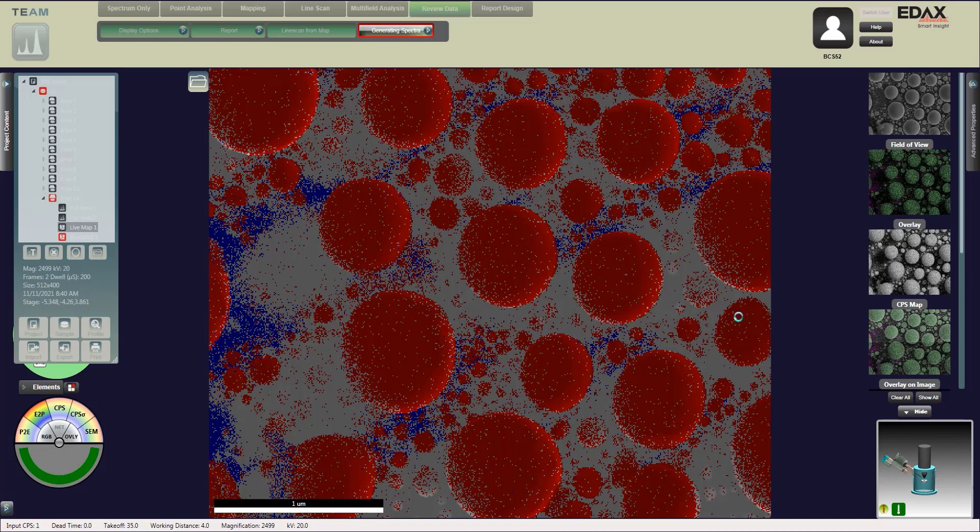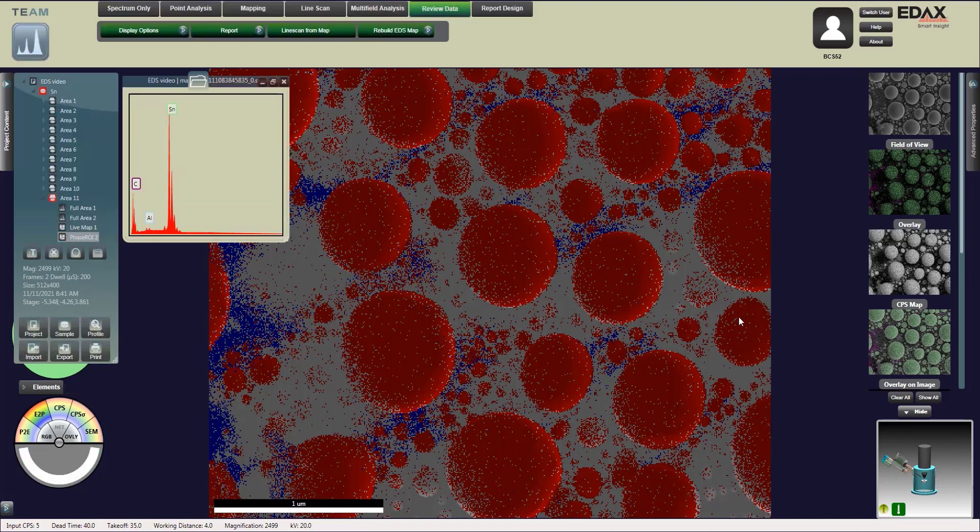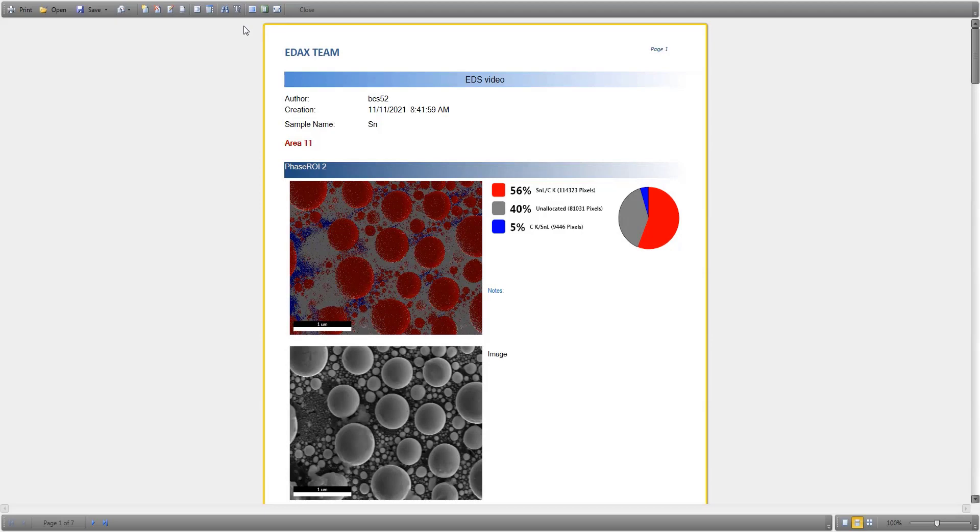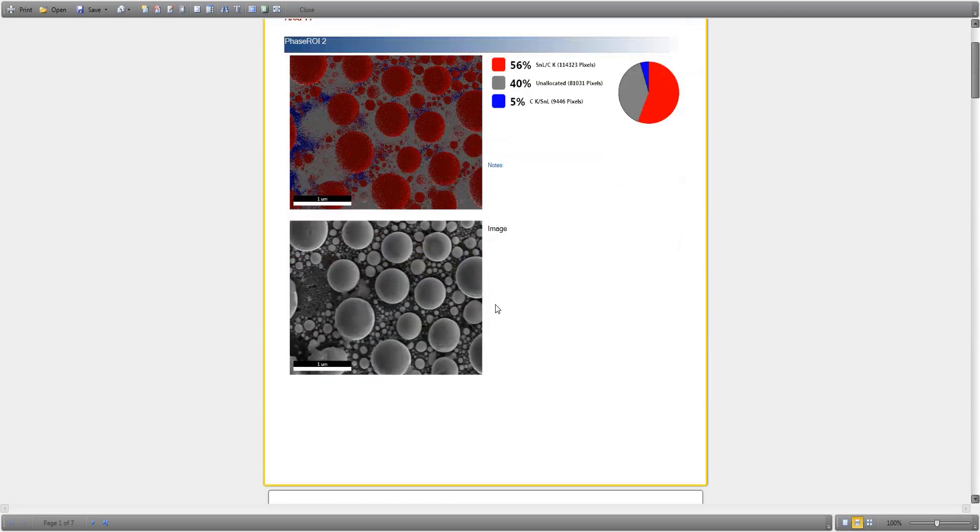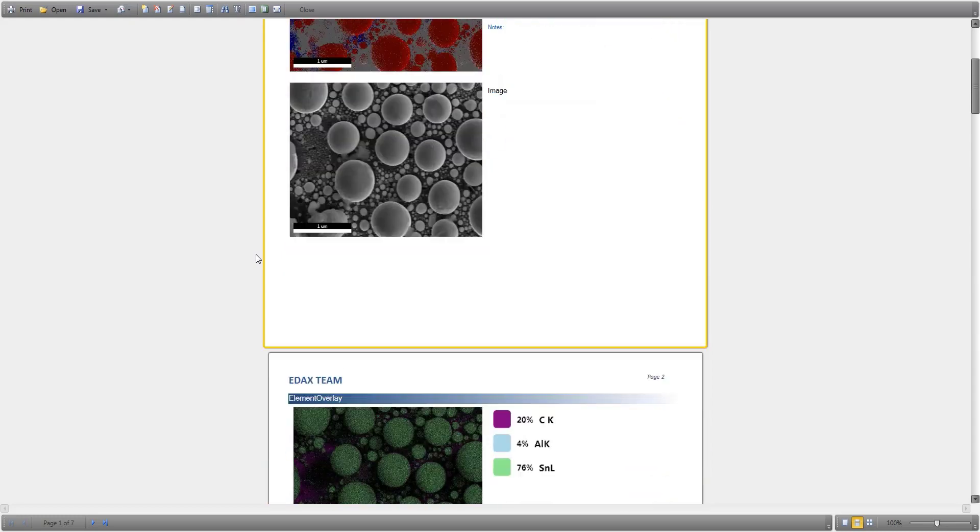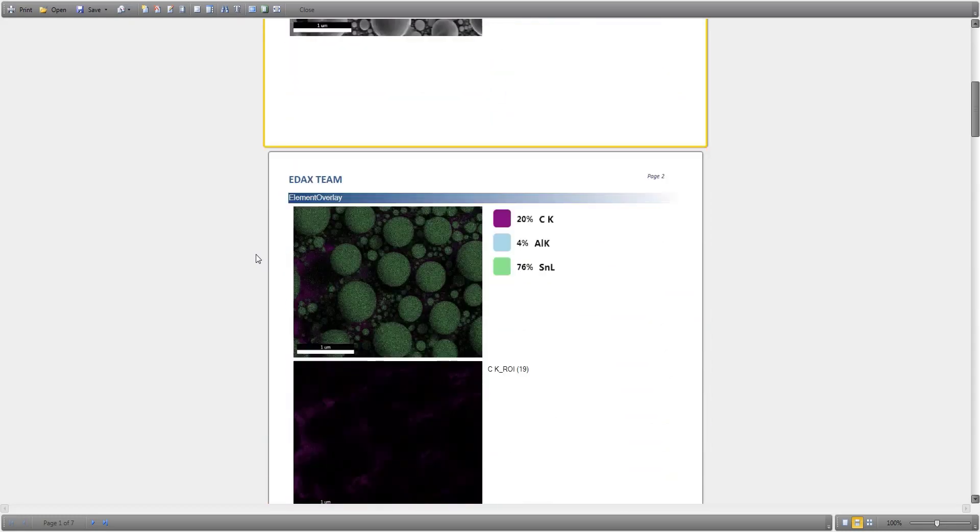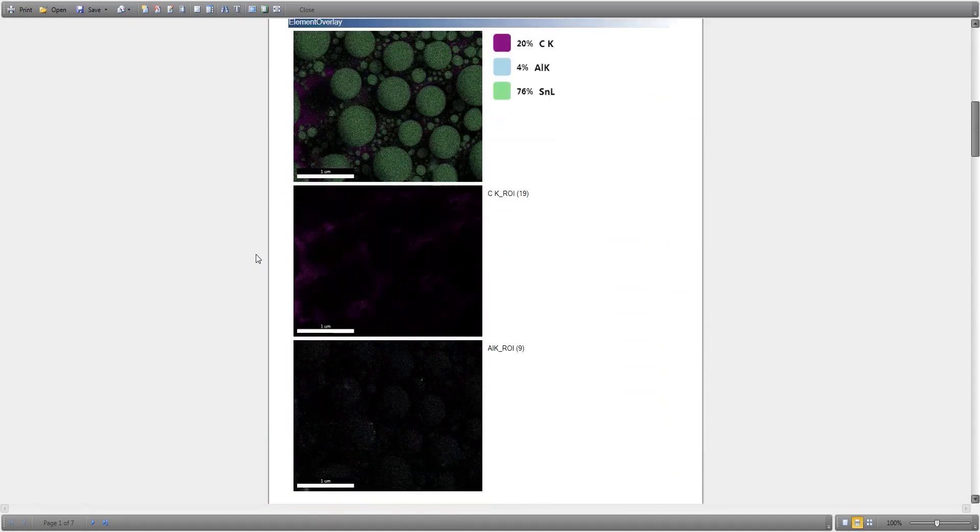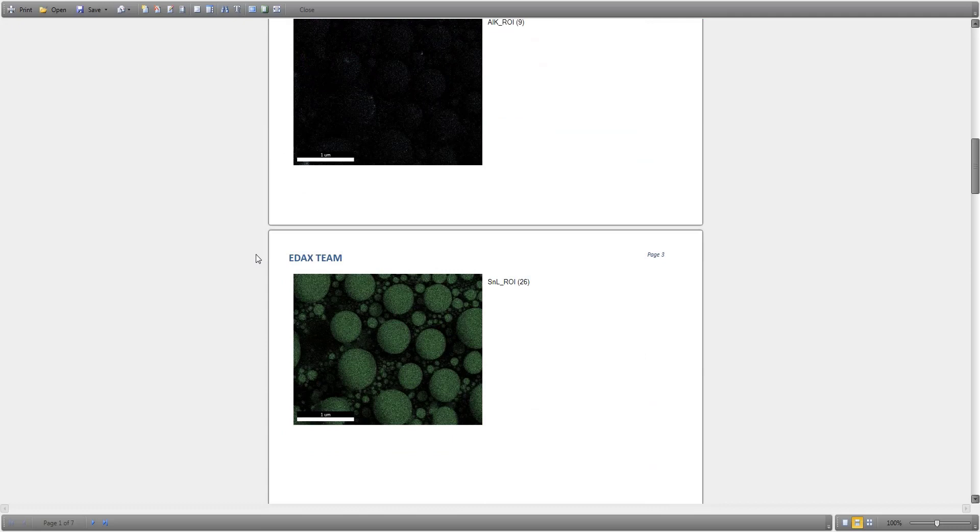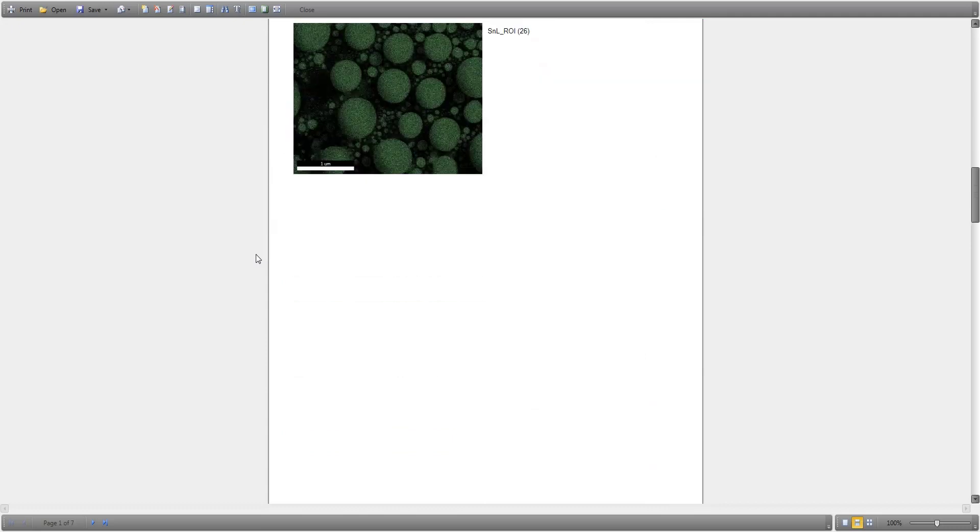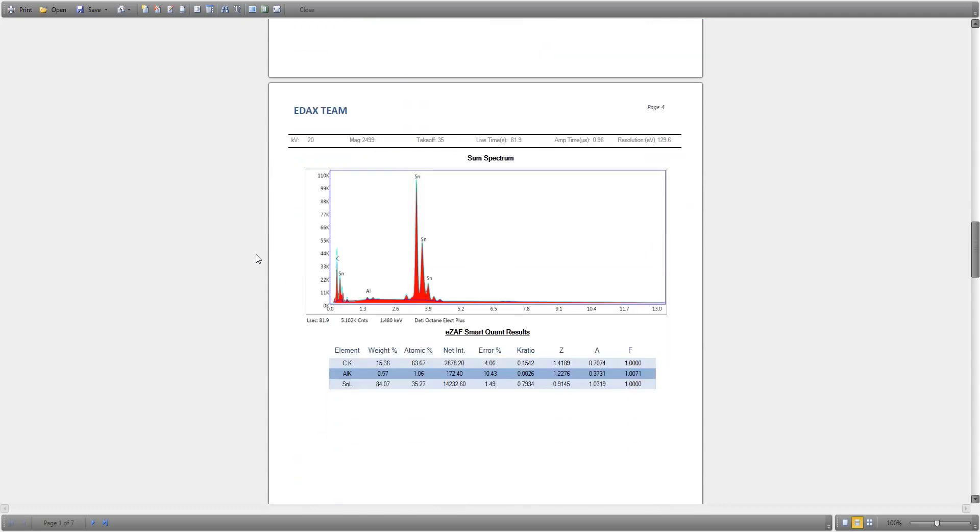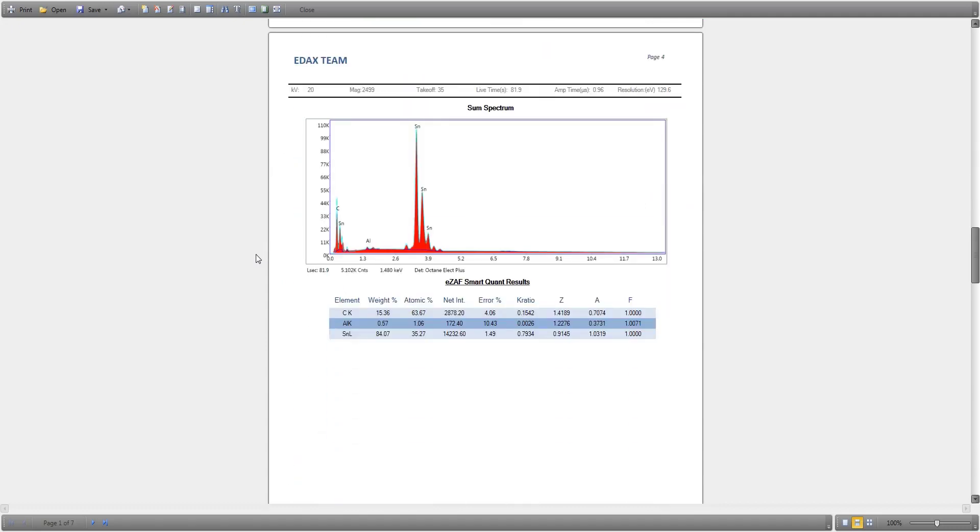Now we're going to take a look at the report. It's going to give us our phase map, our image of the area that we're just taking. Then it'll do the overlays of the elements according to their positions with that image that we took. At the very bottom it's going to give us our sum spectrum and the elements and also phase identification.